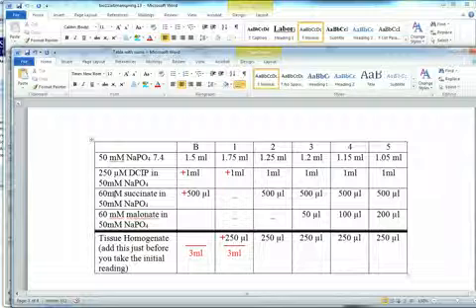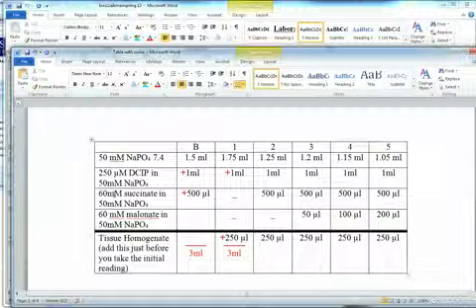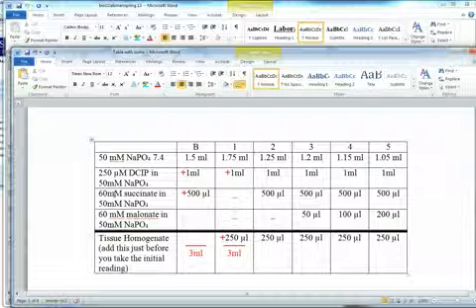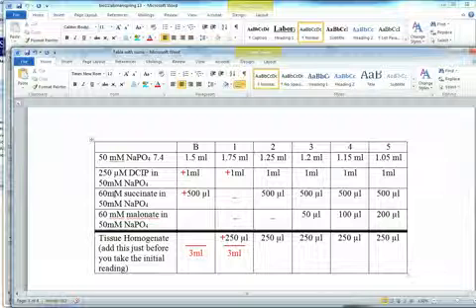But just about any concentration of succinate could be used, 100 millimolar or 230 millimolar or 2 molar. Obviously you wouldn't use too much if you had 2 molar, but whatever you had, it wouldn't matter as long as you used the right volume of stock so that the final concentration, once it was diluted in whatever total final volume you had, would be 10 millimolar.